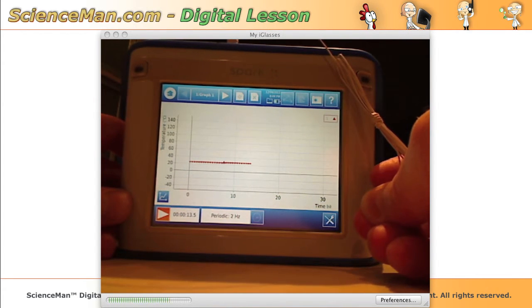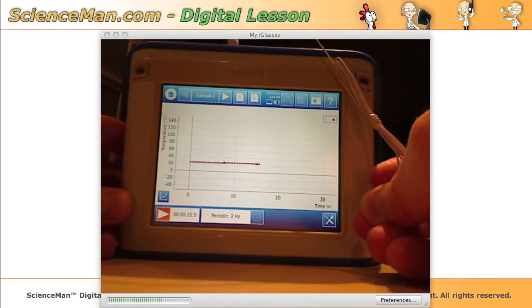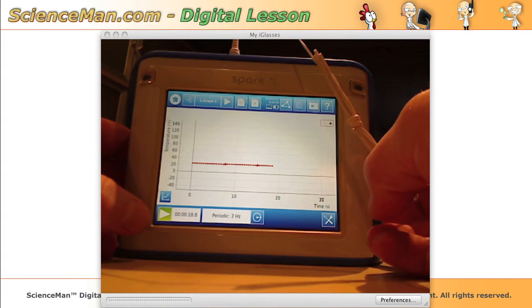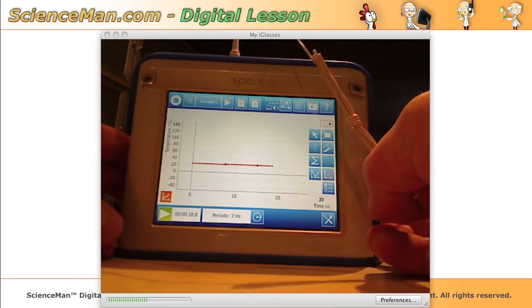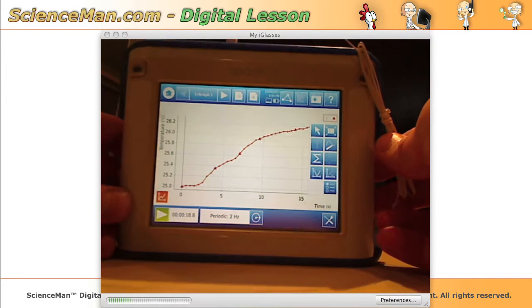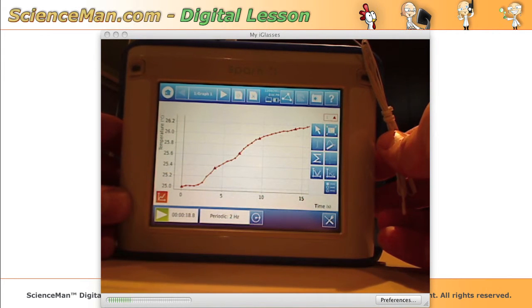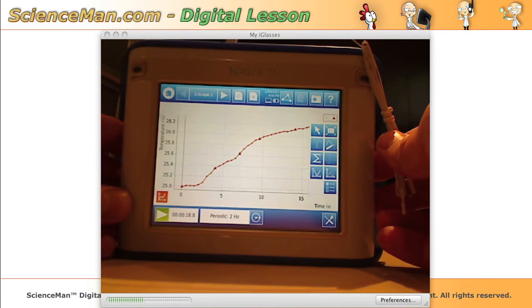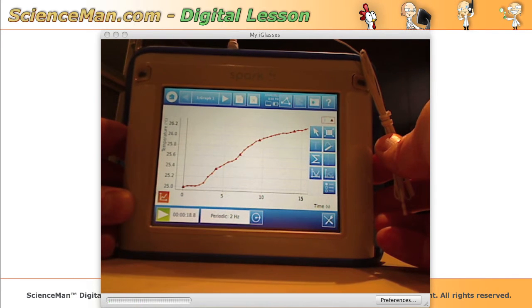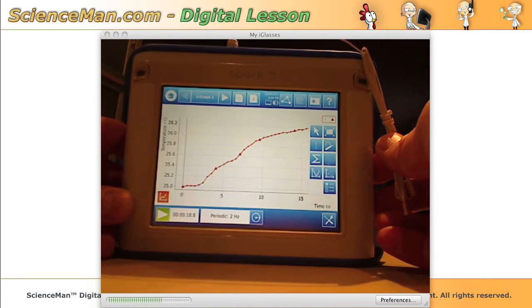Of course, the scale on the left is totally inappropriate — it's 0 to 140 — so let's stop collecting data, press the tools button, and press auto scale. And there we are, that's beautiful: temperature from 25 to 26 degrees. We've done our first experiment within a couple of minutes of having opened the box, so it does pass the intuitiveness test — very nice and easy to use.